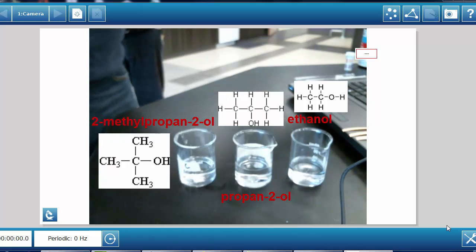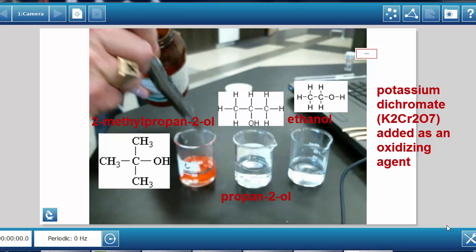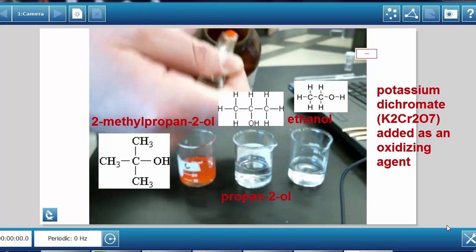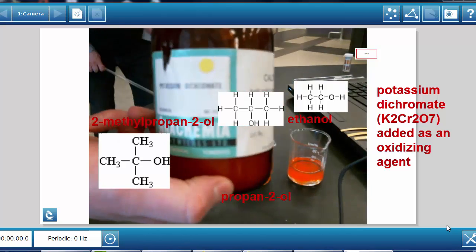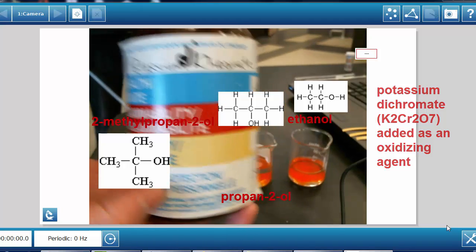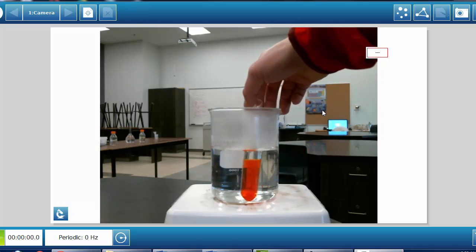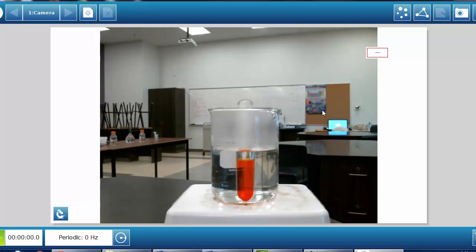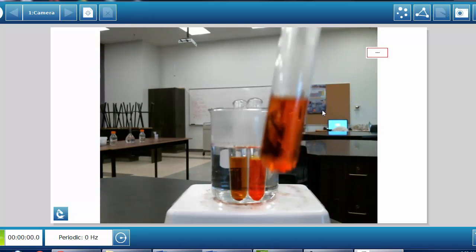So what we need is potassium dichromate. Okay, the dichromate ion, so Cr2O7 2-, is a very powerful oxidizing agent. This could also be done with the permanganate ion. Either way, you can see there's a very bright orange color formed from this. So when an alcohol reacts with an oxidizing agent, the alcohol itself, those carbons are oxidized, and the oxidizing agent, remember, is reduced. So chromium in the 6+ oxidation state is going to form chromium 3+ when it's reduced, and chromium 3+ is a very dark green. So I will look for the color change.